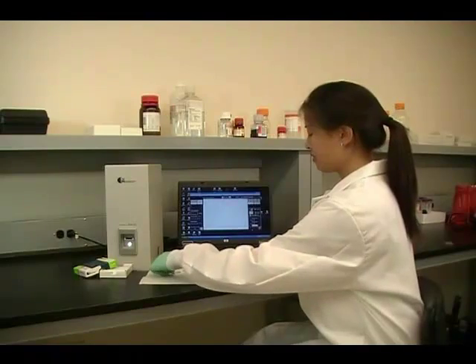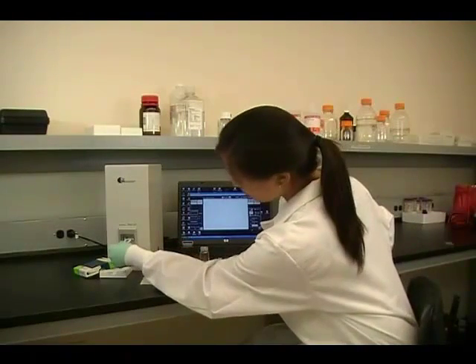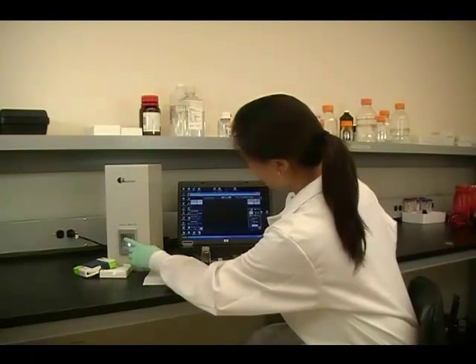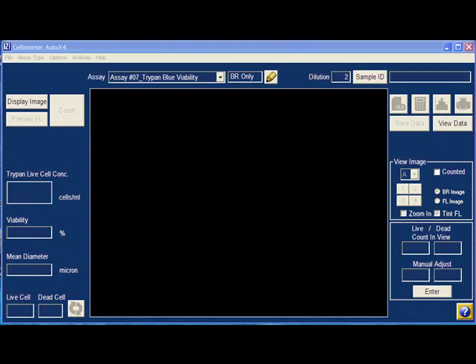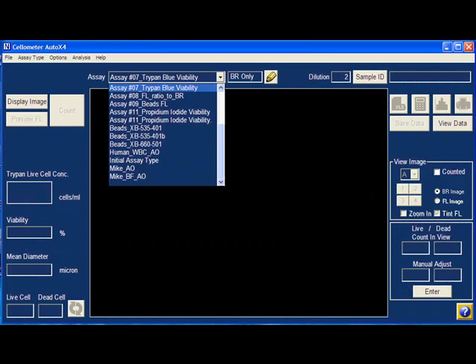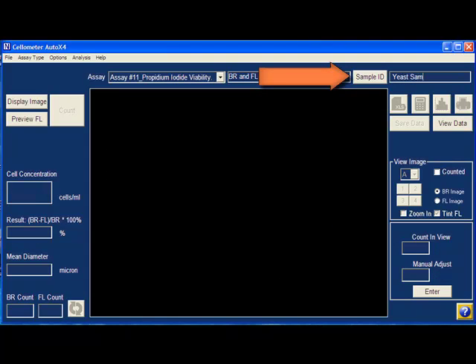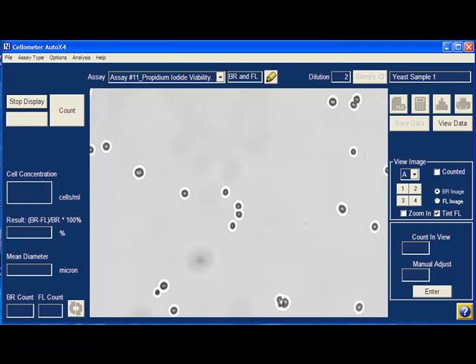The chamber is then inserted into the Cellometer Auto X4-10X cell counter. After selecting the assay type and entering the sample ID, the brightfield image will appear on the screen. After focusing, click Count.